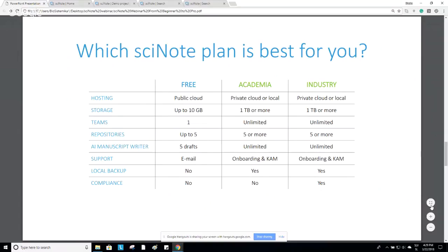On top of all that, we also offer site license possibilities for the larger institutions. The pricing is based per user. However, the exact price for the package depends on all the different variables and quantity of the certain features you would need.